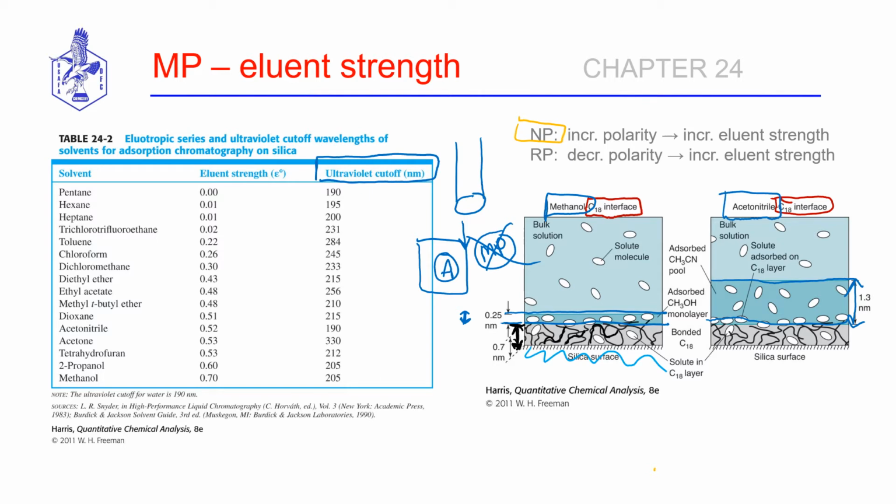It is the partitioning of our solute molecules into and out of both the layer of the mobile phase and into the stationary phase that's going to affect our peak shape as well as how long it takes for our solute molecules to come off the end of the column. So selection of the mobile phase is very important in terms of our detection mode as well as the time it's going to take for a separation and the shape of the peaks that come out at the end.